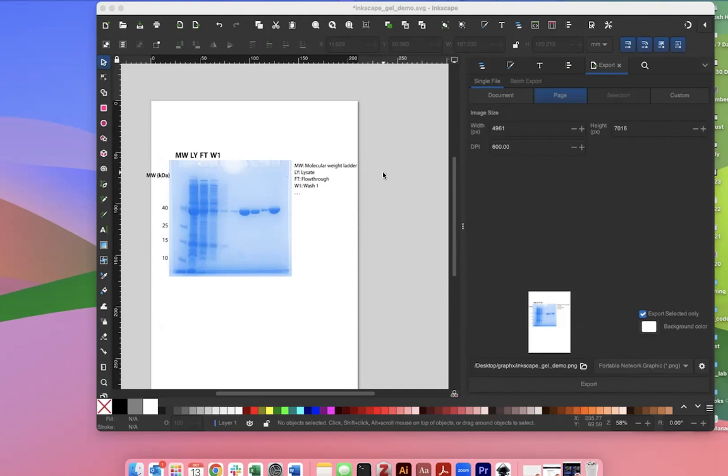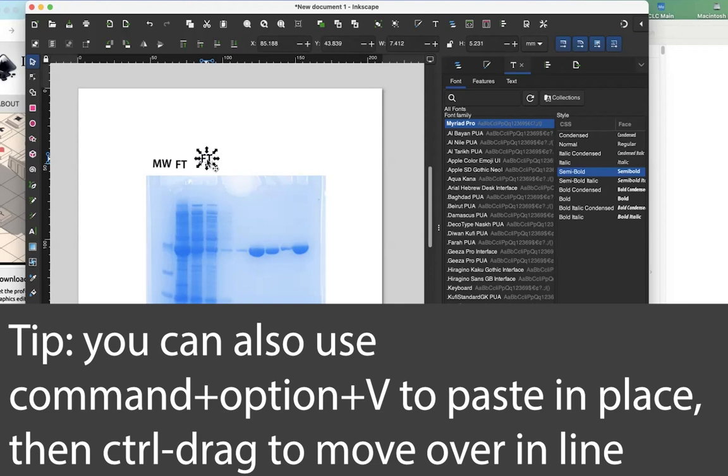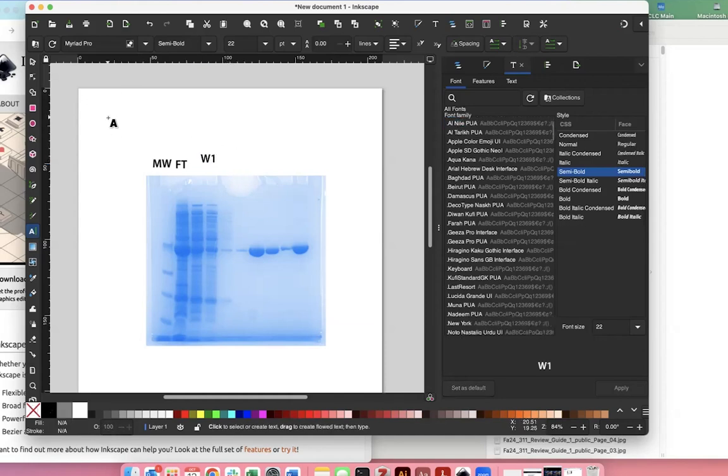But in order to do that, I needed to save the file, the SVG version, which thankfully I did. So I can either just copy and paste this, so Control C, Control V. When you're clicked on something, if you press T, you can easily edit it and change it out. Or once you set it as default, if you just start a new text, it'll say the same.